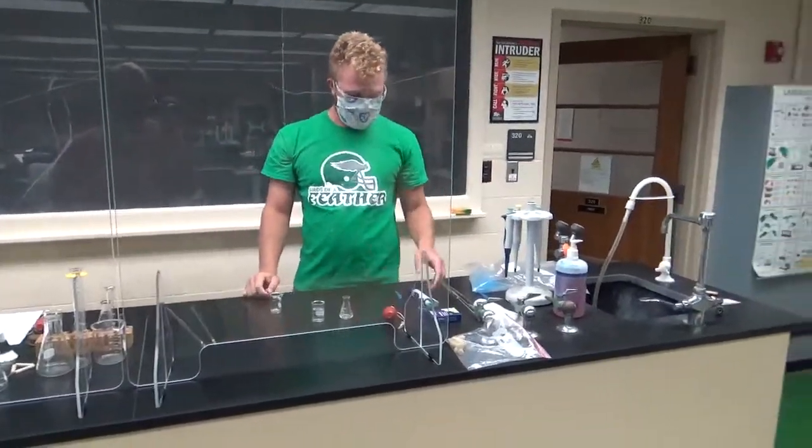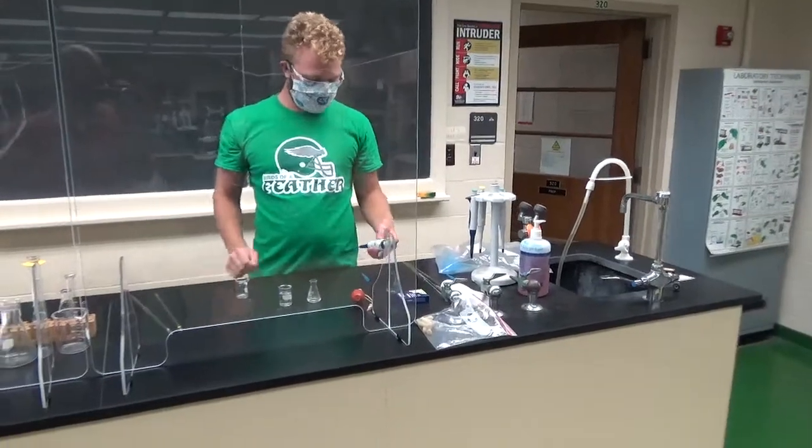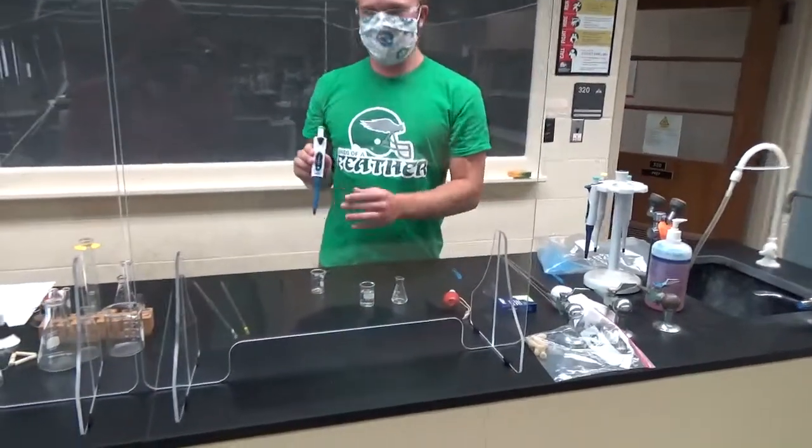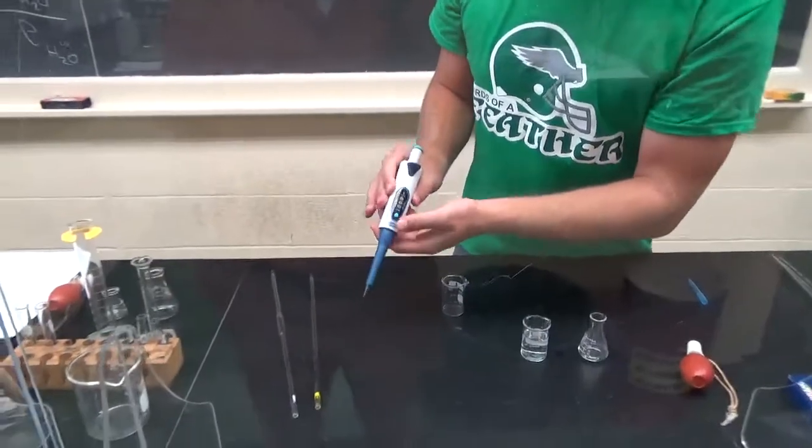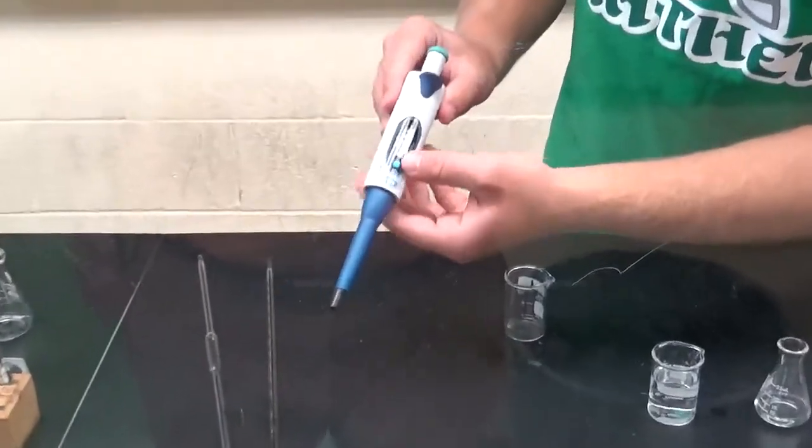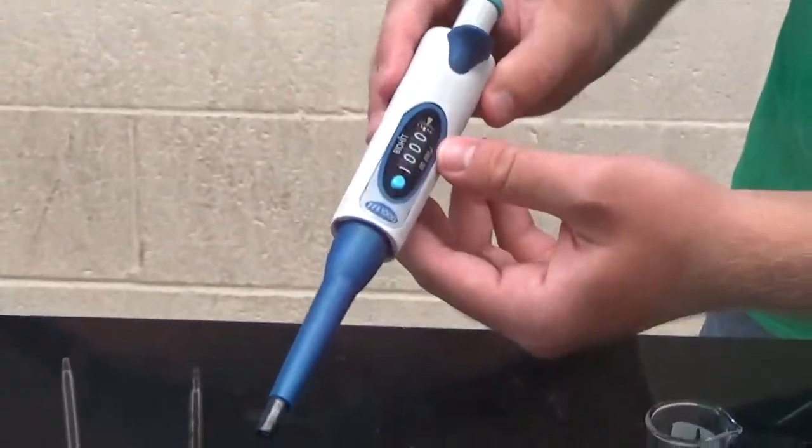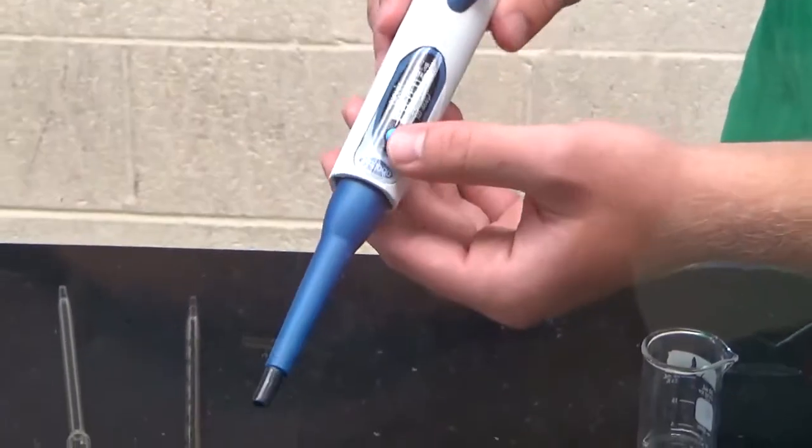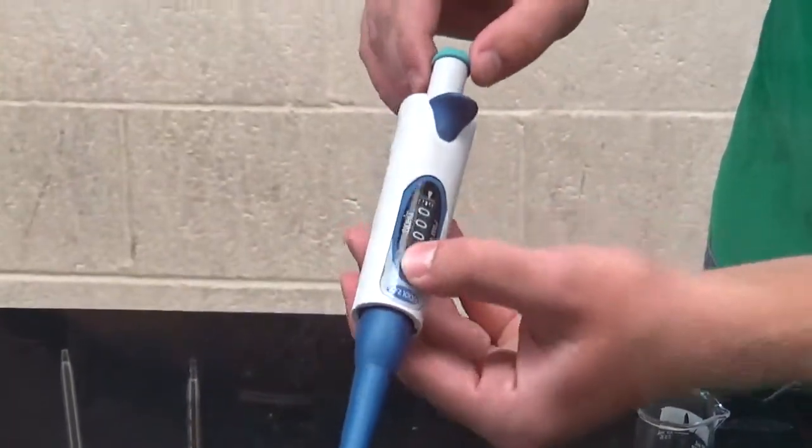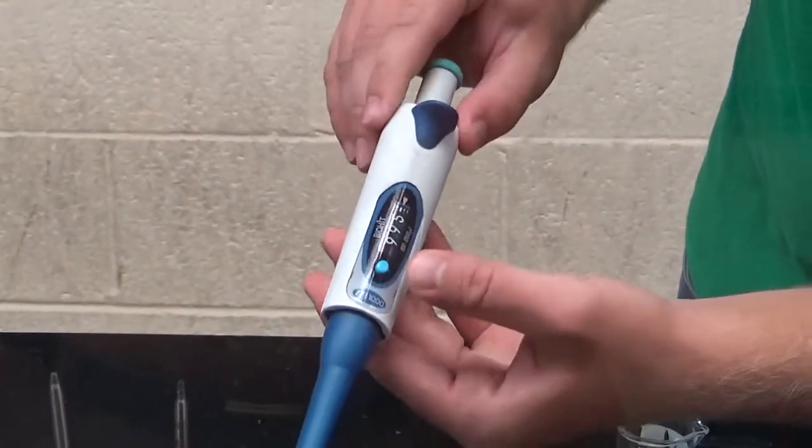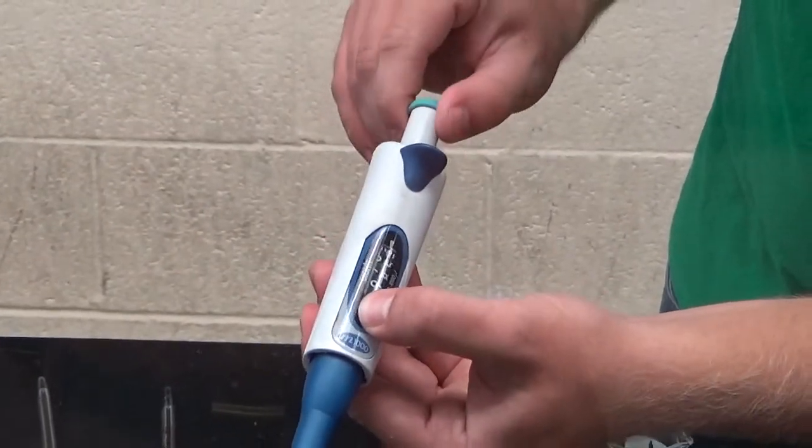Those are two of the three pipettes. The last one, if you've had a biology class, you're probably really familiar with. Here's an automatic pipette. If you're going to change the amount of volume, right now I have a thousand microliters, which is one milliliter. To change that, you press this button and you turn the dial here. Gently.